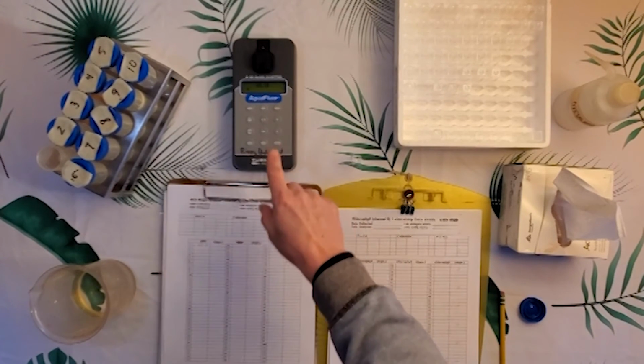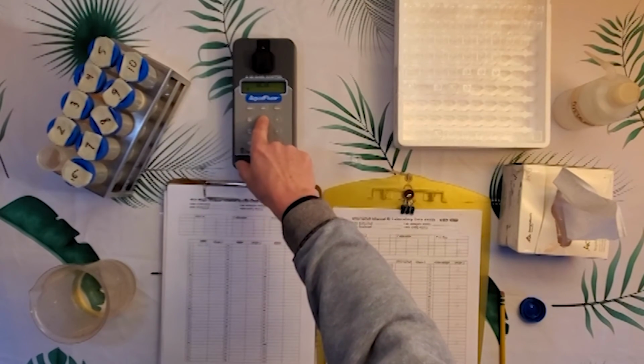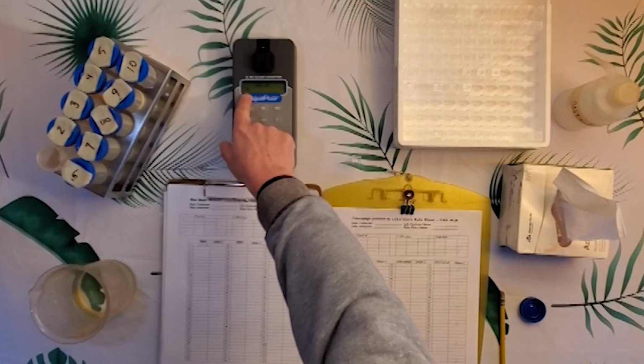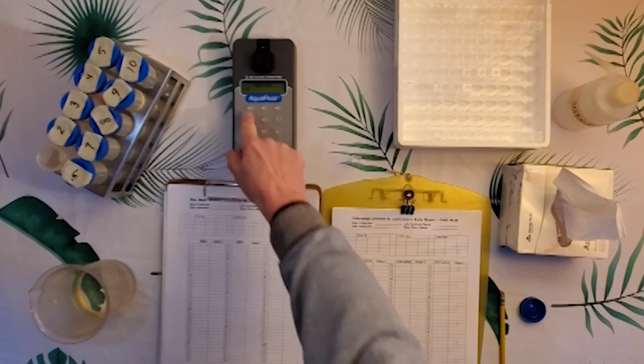And then for the chlorophyll, we're going to hit that A-B button again here. We'll see that shifts over to the B channel. Again, we'll read.